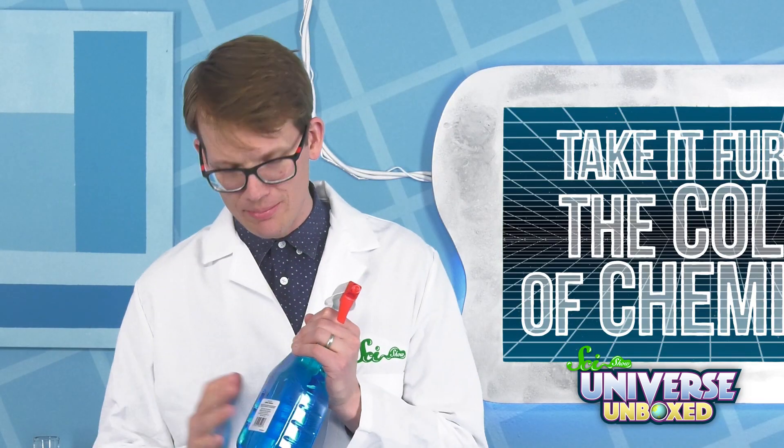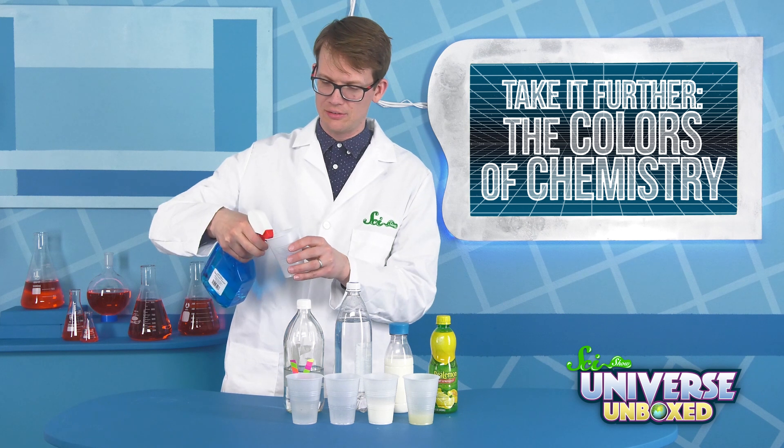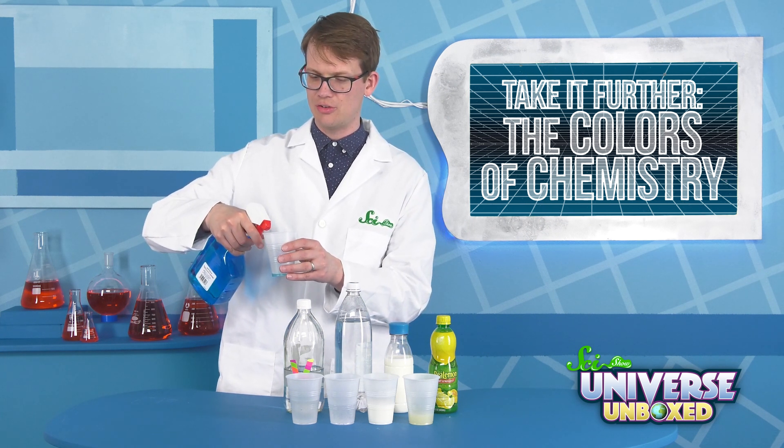I've looked at the ingredients, and I feel like we should get a better result from this. We're not going to put a ton in here, because once you put a little bit in, you'll note that there is a smell coming off of it, and that smell is ammonia, which makes me definitely think we're going to see a color change reaction here.